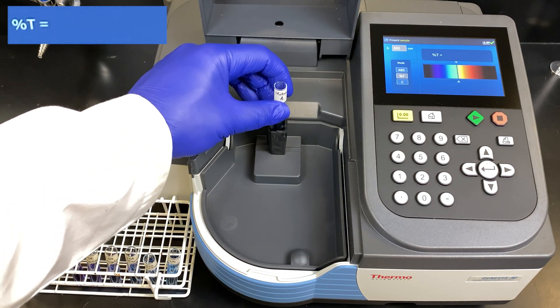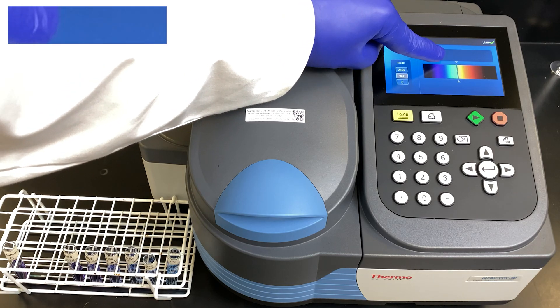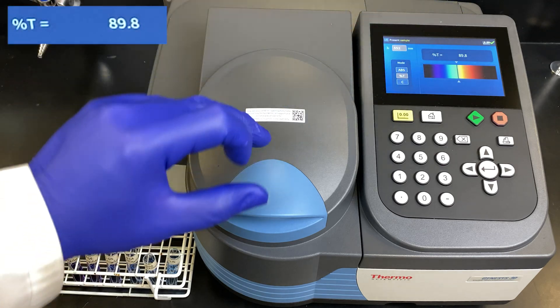Now our unknown, unknown A, the lighter colored one. Place it inside, close the door, wait for it to stabilize. 89.8 appears to be our value for unknown A.